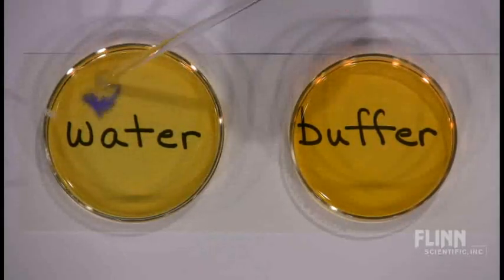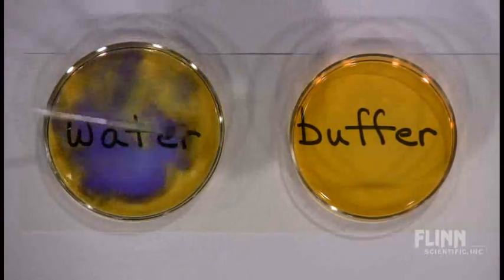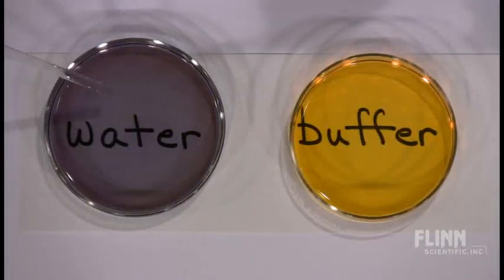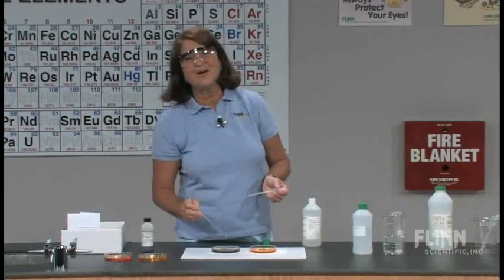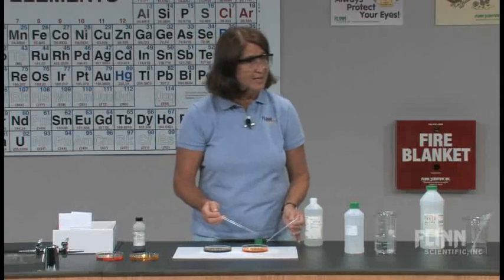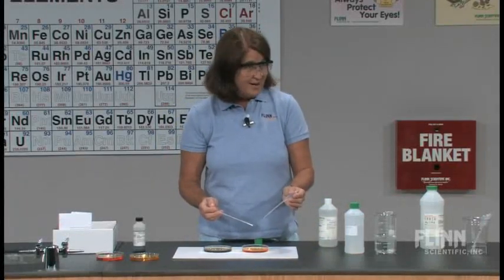One drop — and I'm going to have to stir with the other hand. I think that's a pretty definite color change. One drop gives us a color change with the water. Now write down on your paper how many drops you think it's going to take for the sodium hydroxide to change the buffer system. Got your predictions written? Here we go.